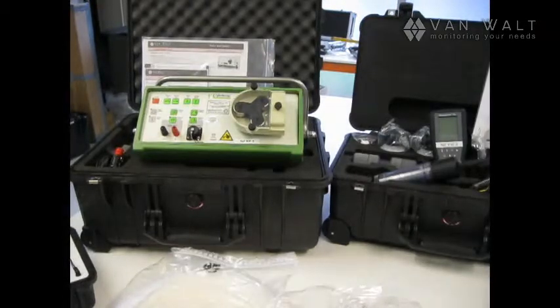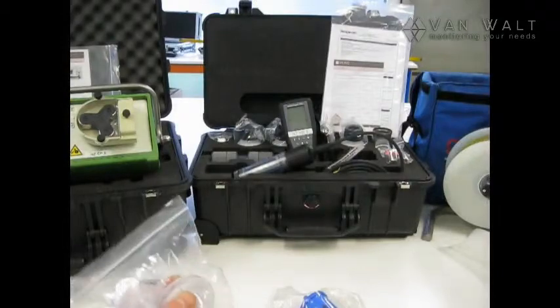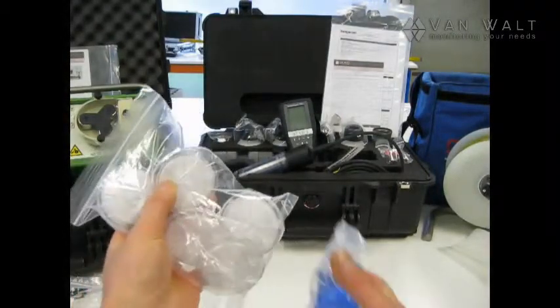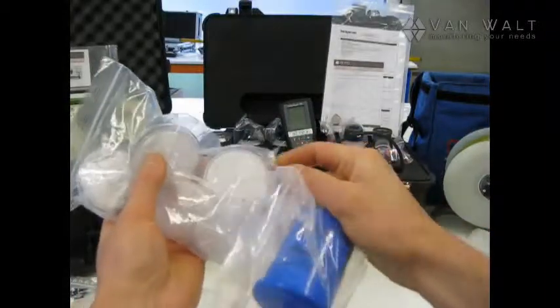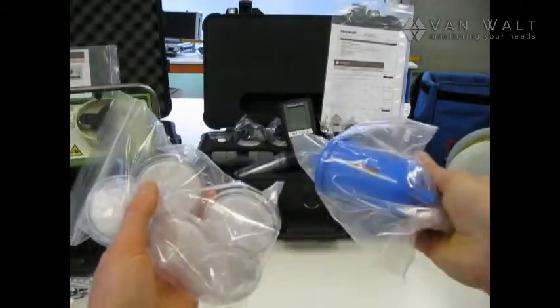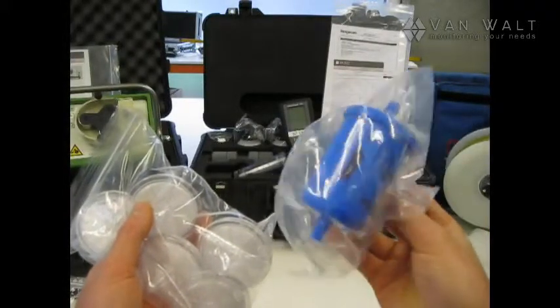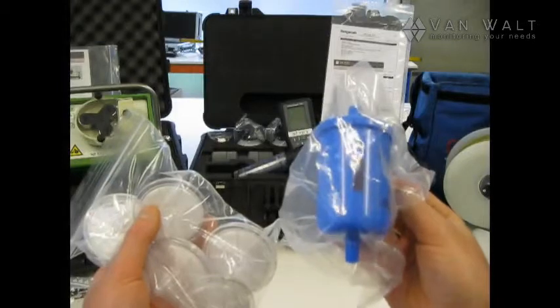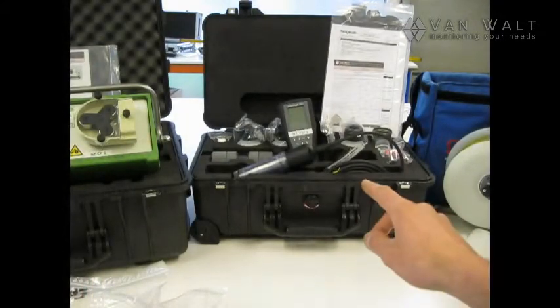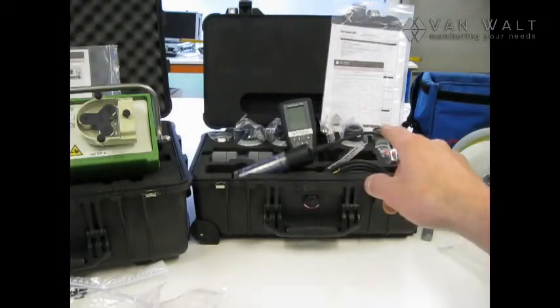Also we have some filters, 0.45 micron filters and these are 20cm square area and if you're sampling particularly dirty water we have the same micron but a much larger 350 square centimetre area. As you can see in the back there we have the ubiquitous YSI with flow cell and calibration fluids.